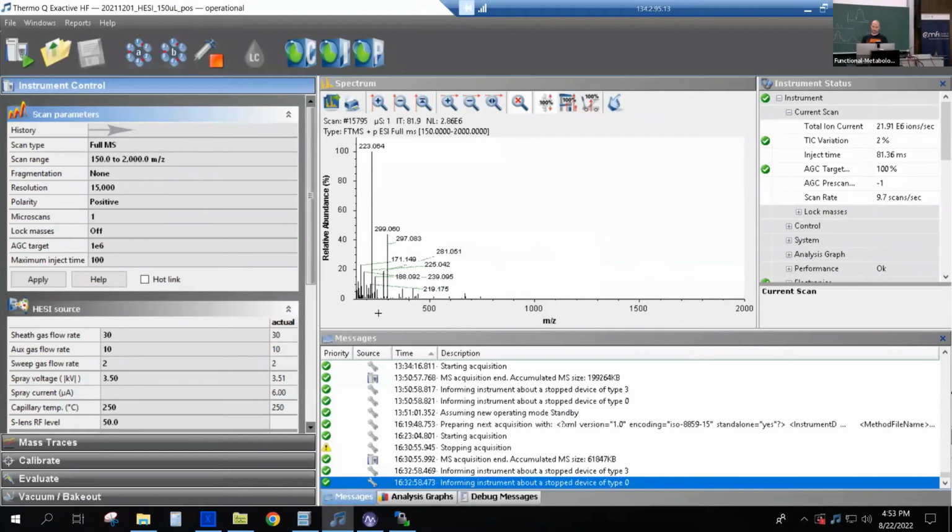So yeah, I'm connected here to the Q Exactive in the lab. And what you can see here is the tune. This is basically just the control interface of the mass spec, and you can see here, okay, it's scanning. So I get some scans here. At the moment, it's just MS1 because I'm not running any samples. So it's just idling.